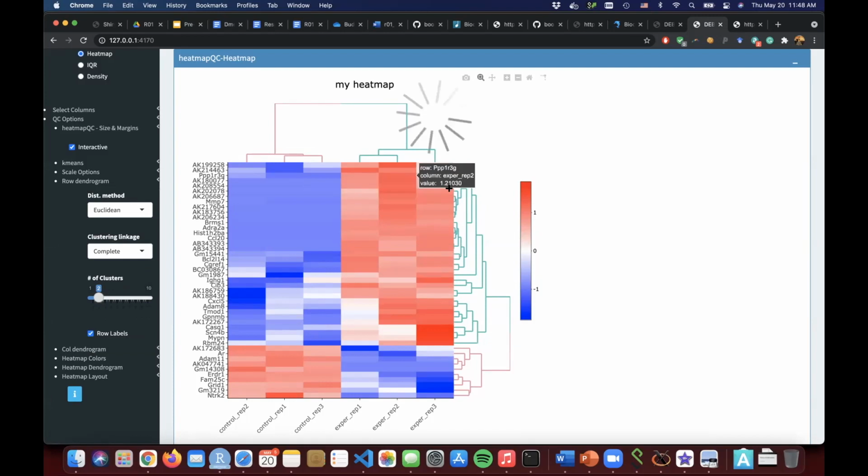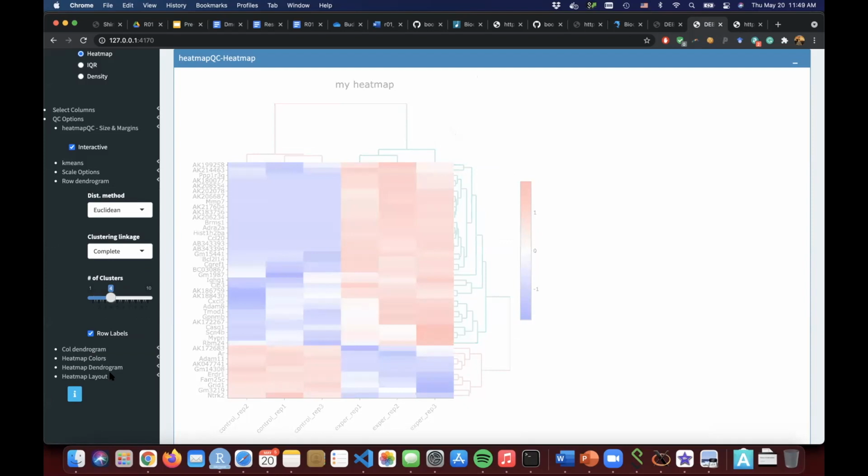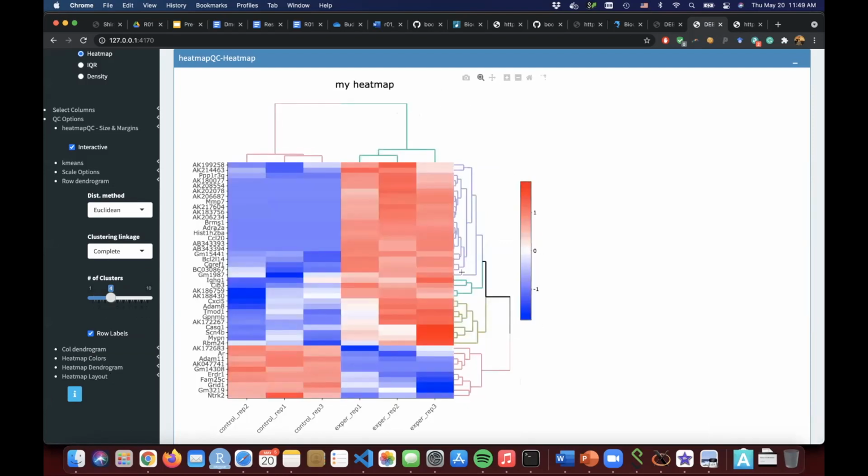So you might think like 1, 2, 3, maybe 4 clusters. You can change the clusters to 4, and it can separate them in the class. See, this is 1 cluster, second one, third, and fourth. Sometimes you use these kind of things in your plots.